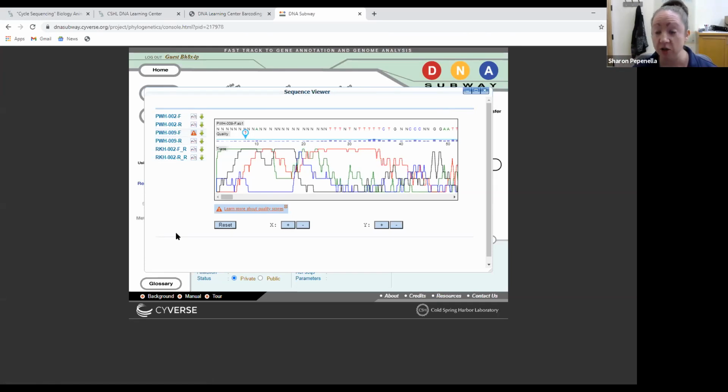Could be for a couple reasons. Could be that you accidentally contaminated your DNA with one of your other samples. So what it's doing is it's sequencing both of those samples at the same time, and it's getting overlapping sequencing data. That's low quality. Could mean that the amplification of your sequence when you did the PCR wasn't great. So you got maybe not a bright band, but just a modest or low brightness in your band on your PCR amplification. So there's not a lot of DNA here. And if there's not a lot of DNA, then it can't confirm the quality of your peaks either. So those are the two most common reasons you'll get low quality sequence.